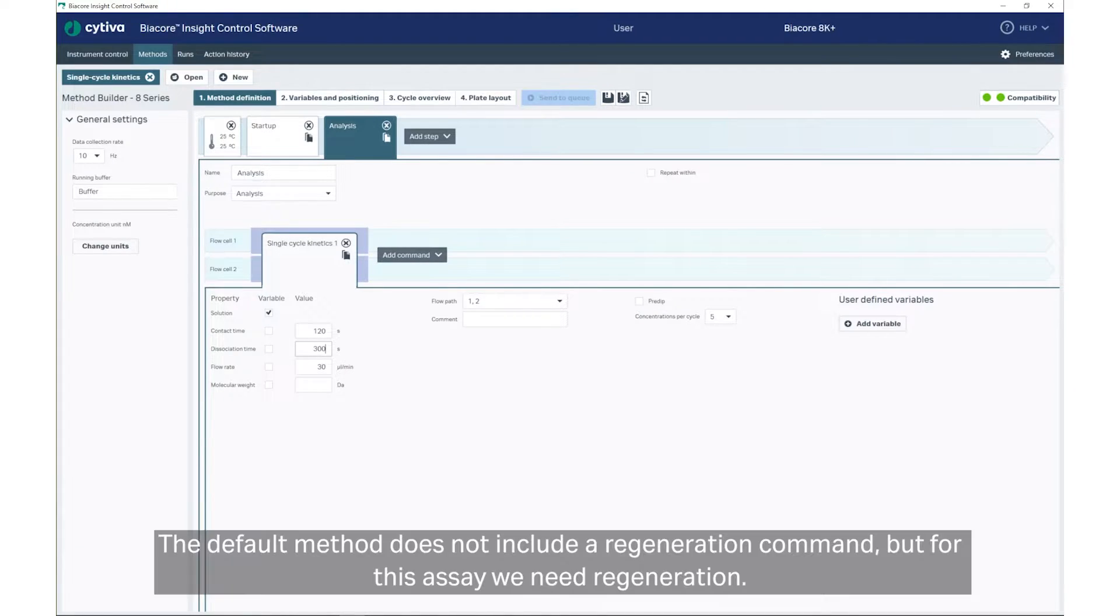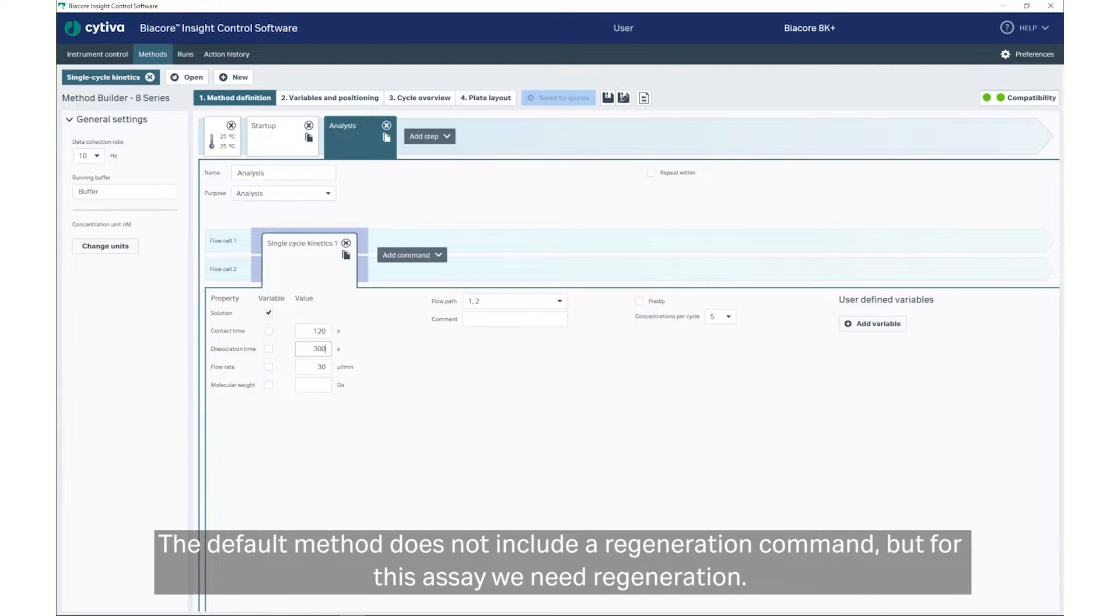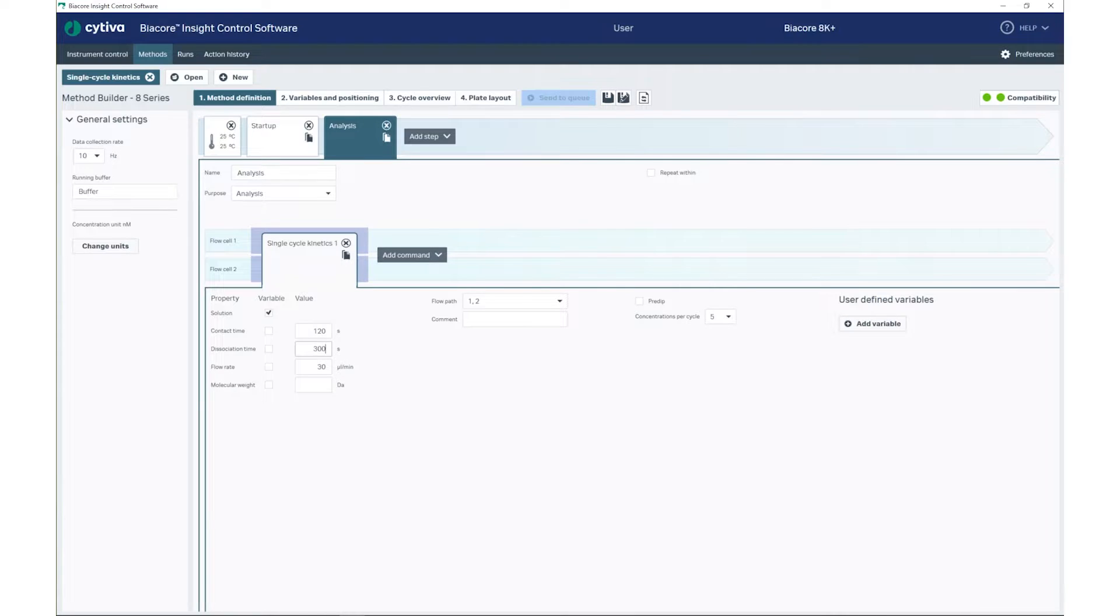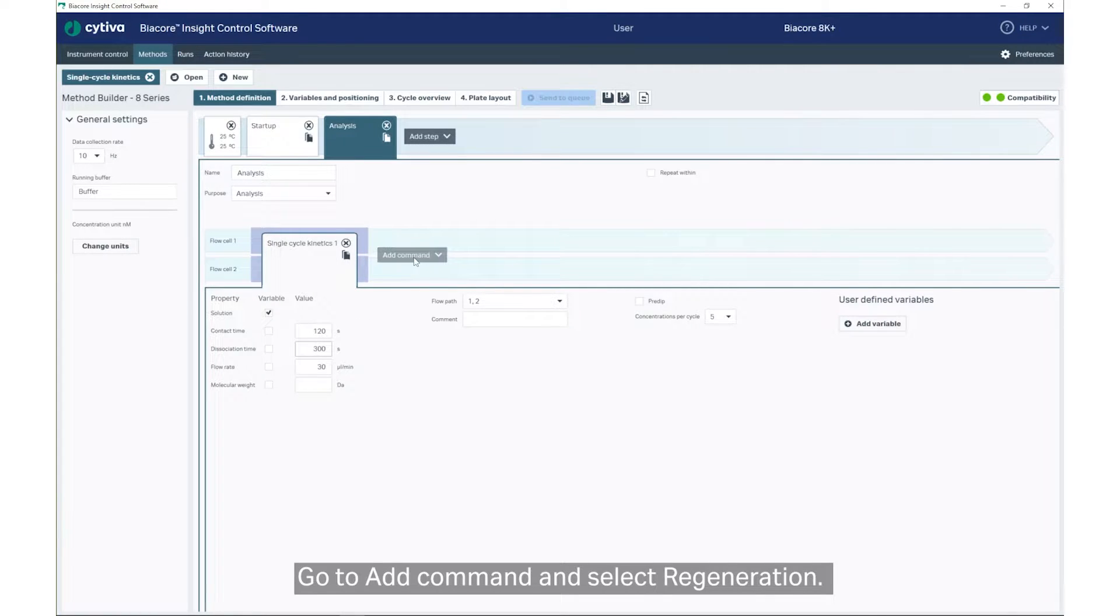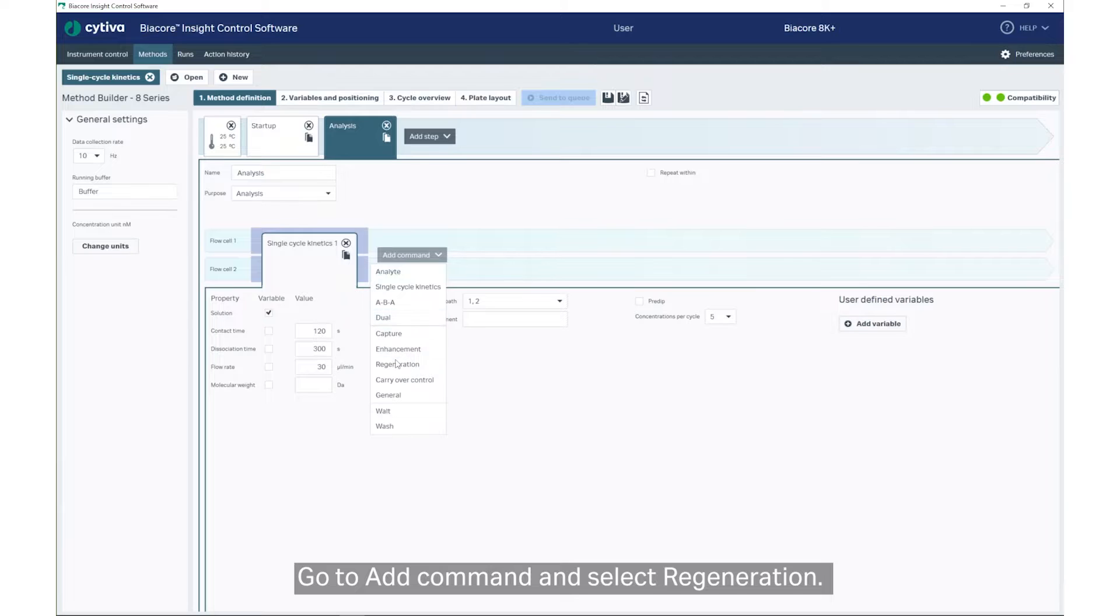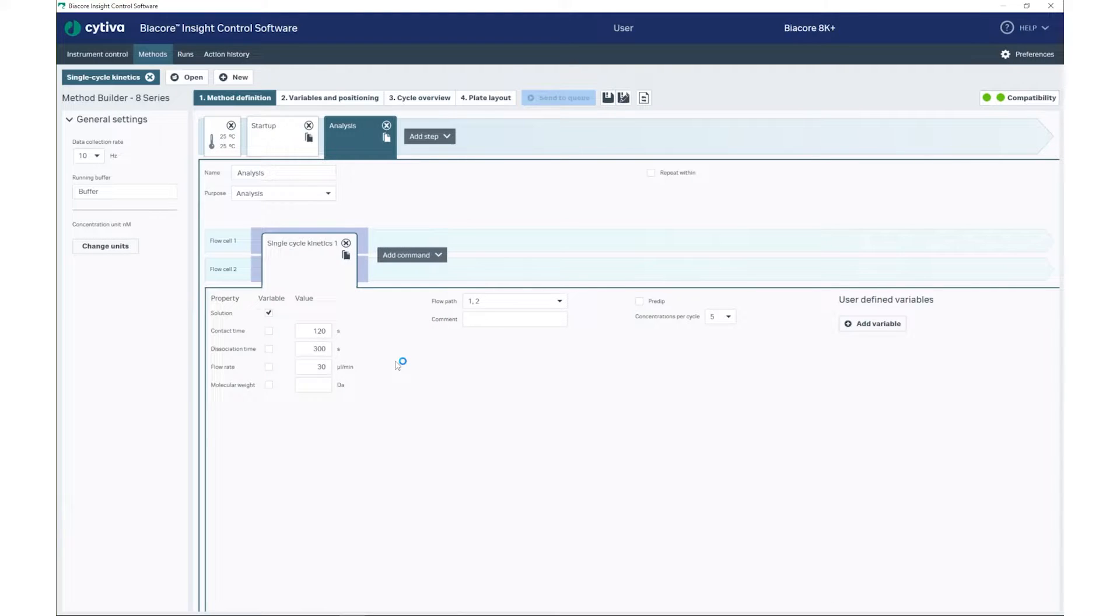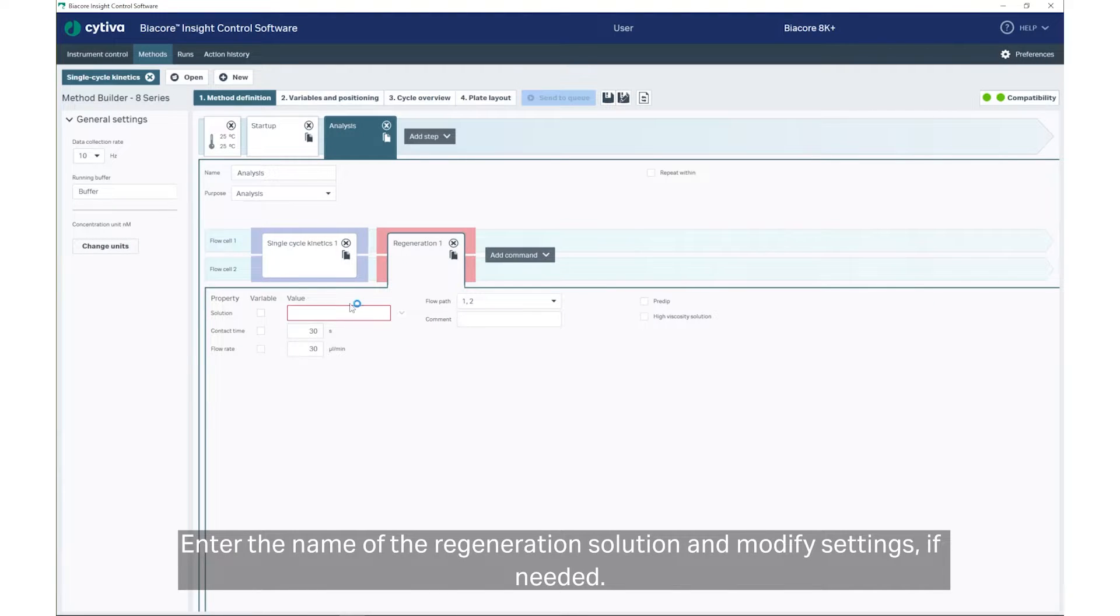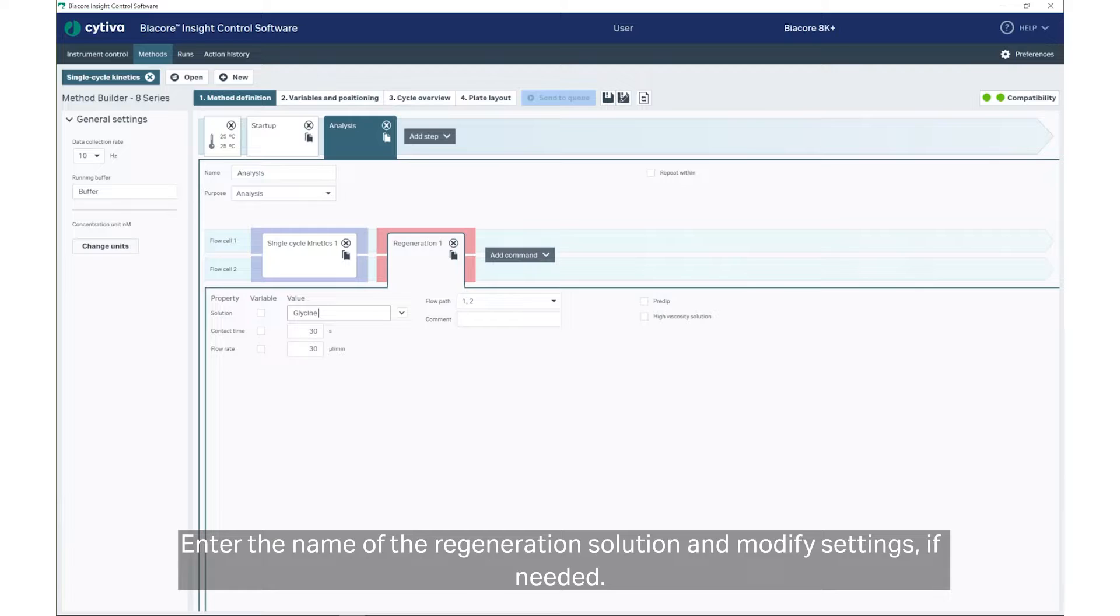Regeneration. The default method does not include a Regeneration command, but for this assay, we need Regeneration. Go to Add command and select Regeneration. Enter the name of the Regeneration solution and modify settings if needed.